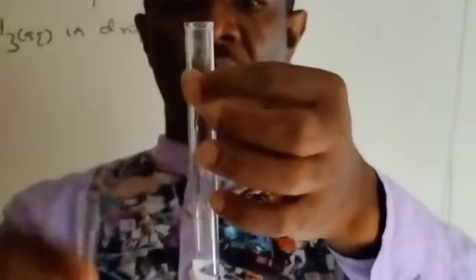So we have our freshly prepared ammonia solution. Remove the masking tape covering it, and then we'll collect a little amount. They say add in drops. Just add a little amount to C aqueous. Come closer to the camera. You see we have a white gelatinous precipitate formed inside the test tube. So you can see that.